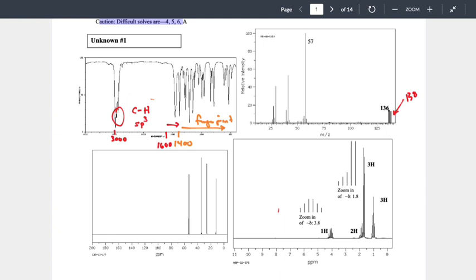Those people, well, what about 3-to-1 in the other fragmentation pattern? Don't worry about the fragmentation pattern. Just ignore it. All we care about is the M plus and our M plus 2. That's your only focus.